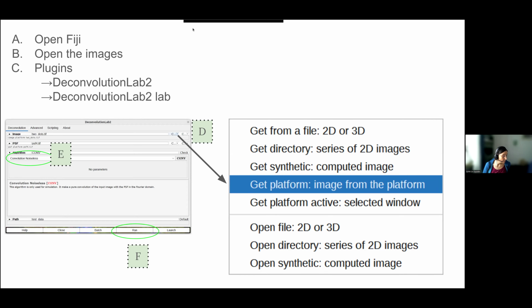Mine says not valid. All I did, I now finally got the plugin, and so I open the Deconvolve lab, and then I say Deconvolve lab to lab or run, or which one should I say? The one that says lab. Lab, exactly. And then I get this window that looks the same as the one you have. And there I select at the beginning the PSF4 image.